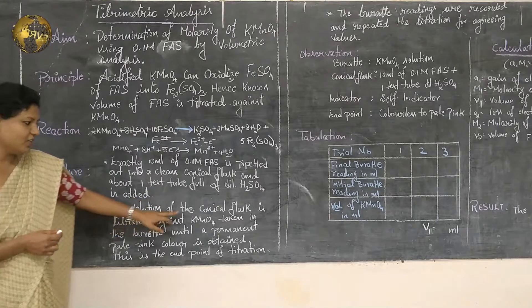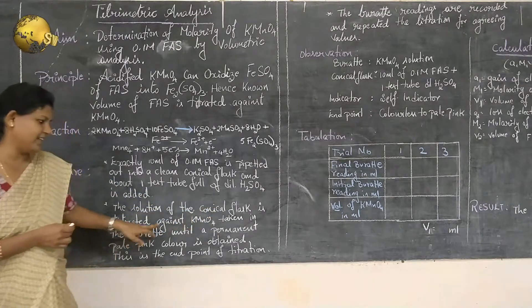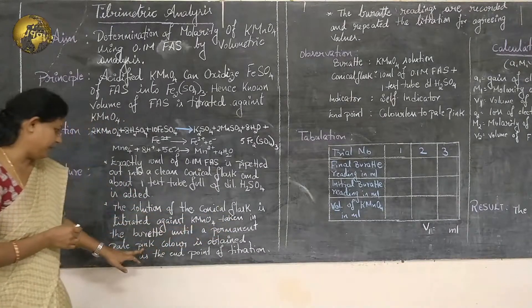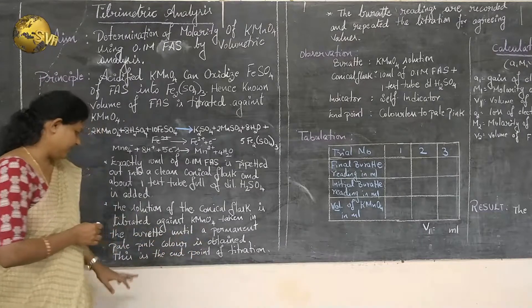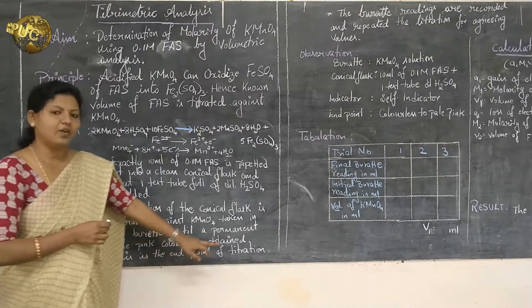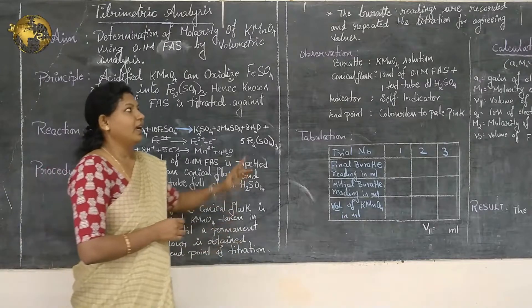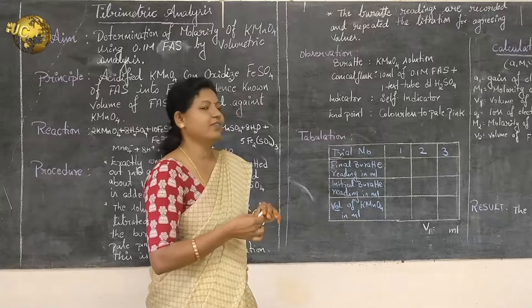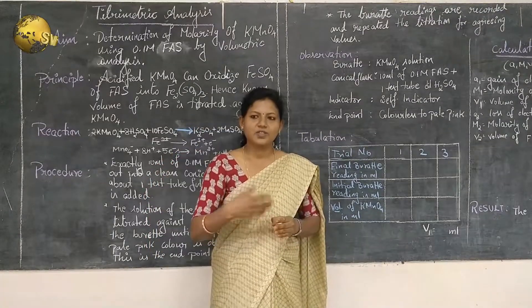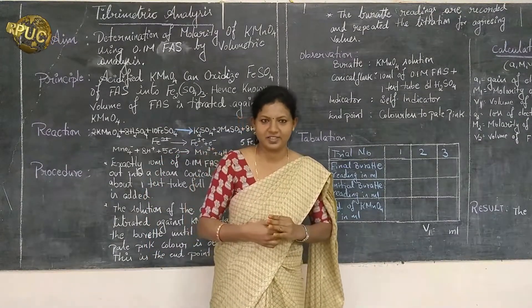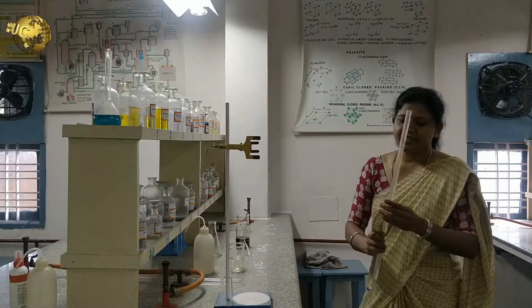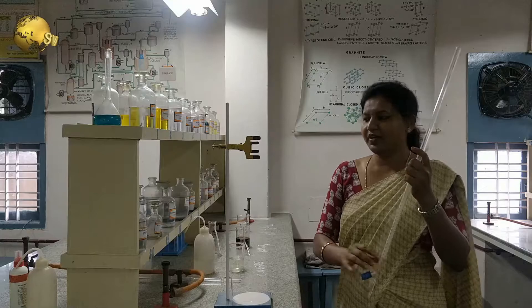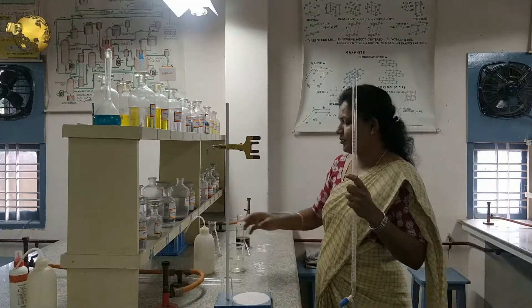The solution in the conical flask is then titrated against potassium permanganate taken in the burette. This is the burette, and this is the burette stand. Before using the burette, first we have to rinse it with distilled water.